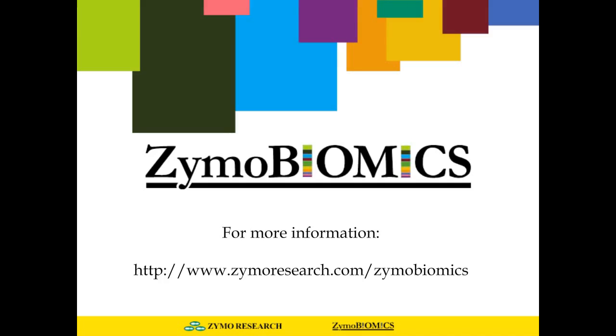Are ZymoBIOMICS standards optimized for high, about 5%, and low fat, 0 to 1% food samples? So to reiterate, I think this refers to the extraction technology. And yes, we have appendices and methods for dealing with essentially any sample type, and then we can work with you on that.